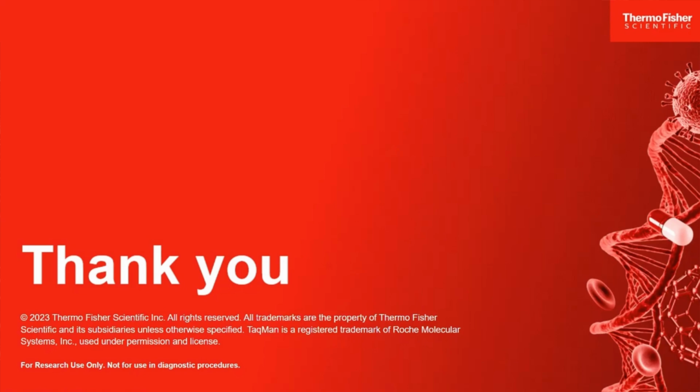Oh, okay. Well, that's kind of a general question. So CT, this is the original terminology, threshold cycle, or CT for short. It's the first, and still most popular, way to collect data points from our real-time PCR data. With real-time PCR data, we're usually going 40 cycles. Presumably, if the target was there, you would see amplification emerging at some point. So we want to select one special data point from each amplification plot, and that special point is often referred to as a CT. We do have some software where it's referred to as a CQ, but it's the same idea.